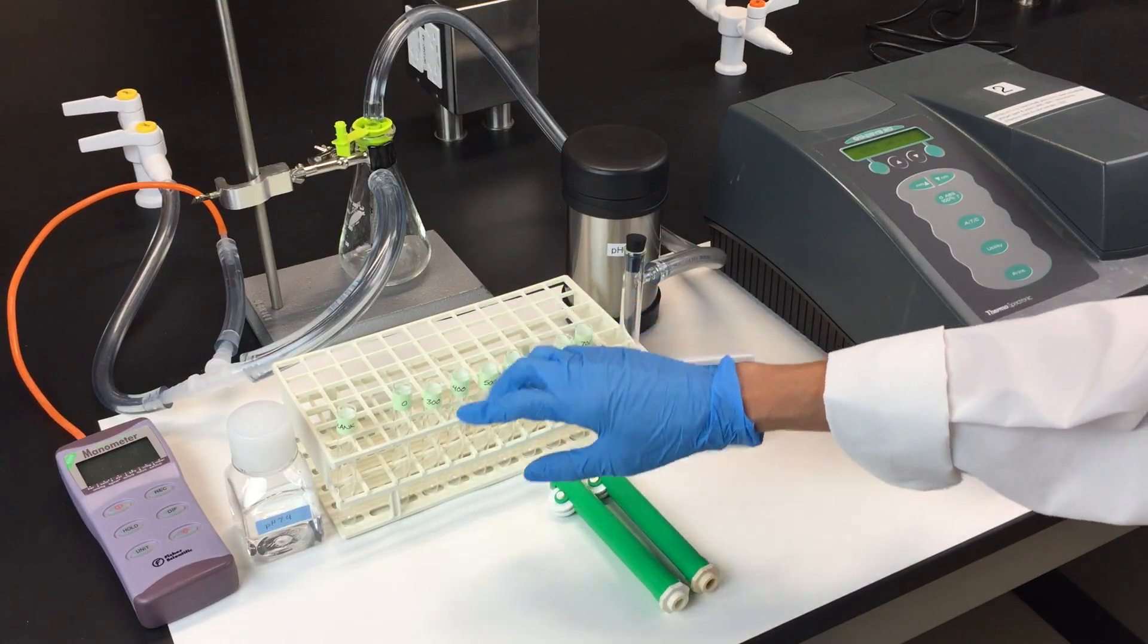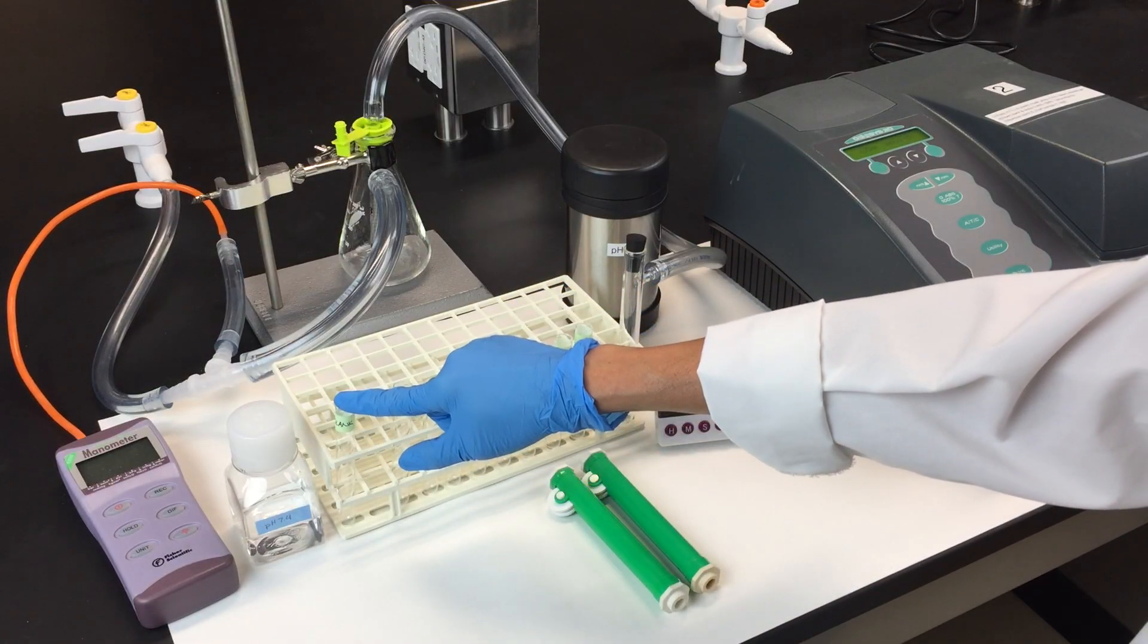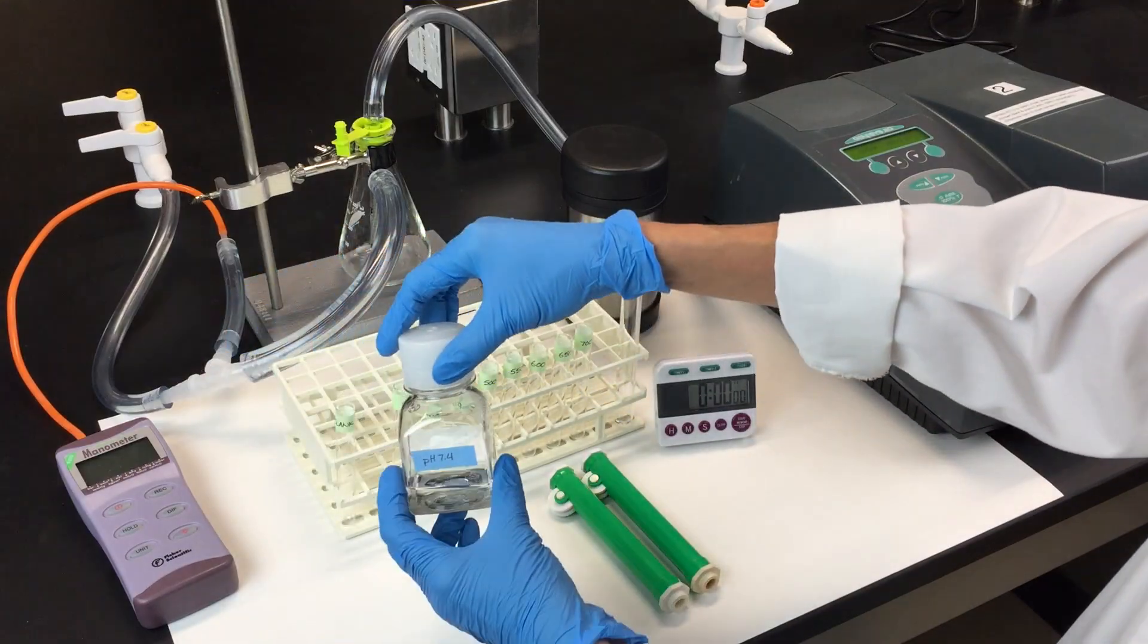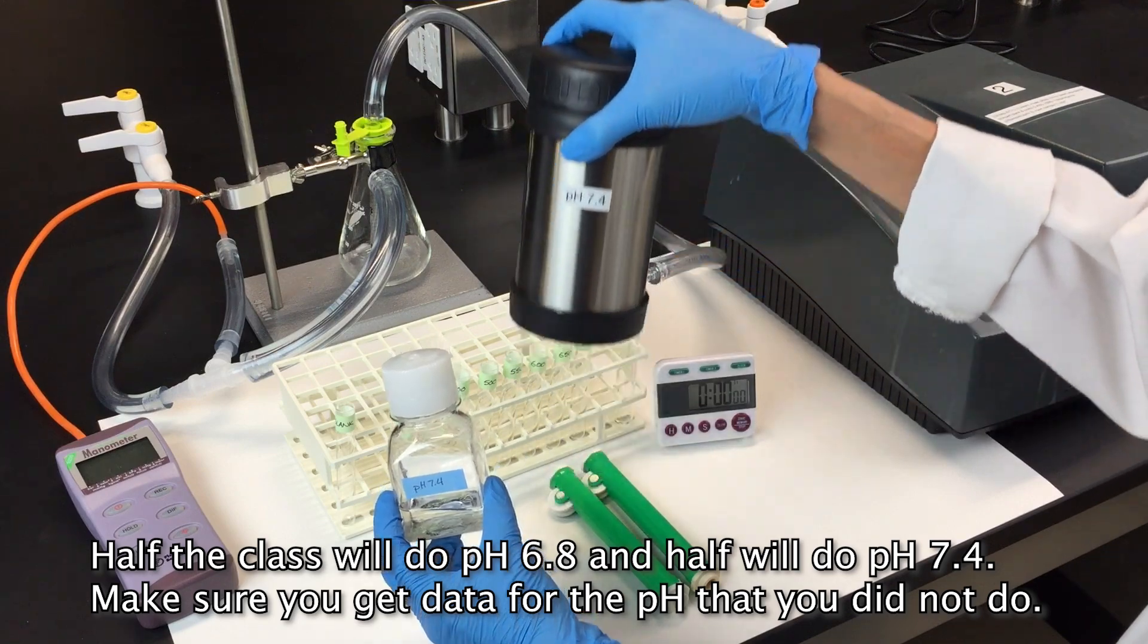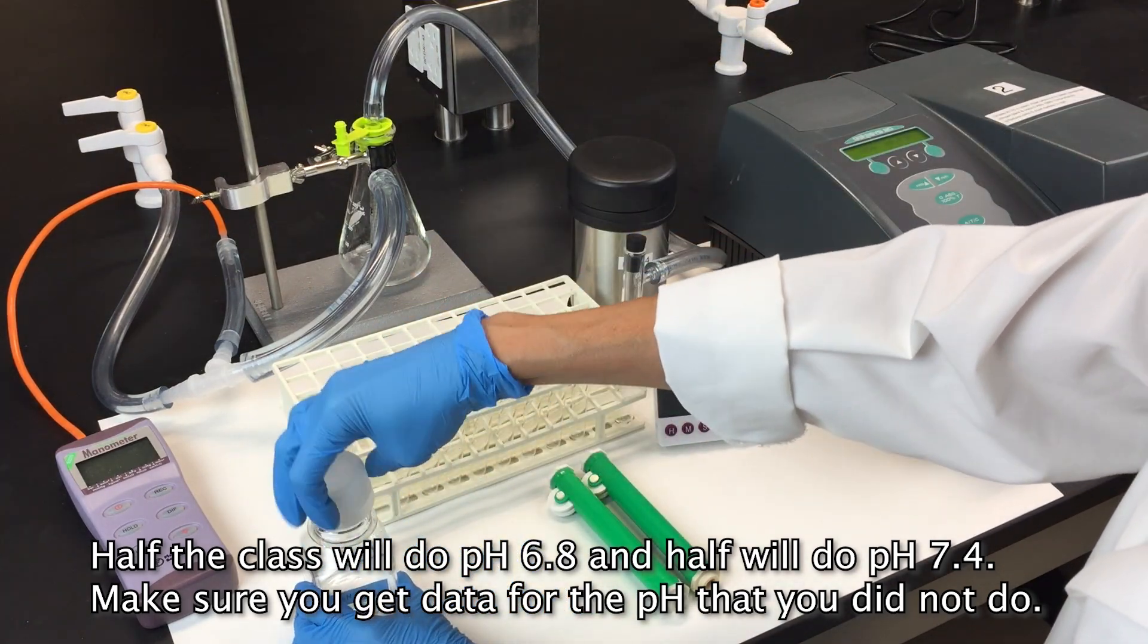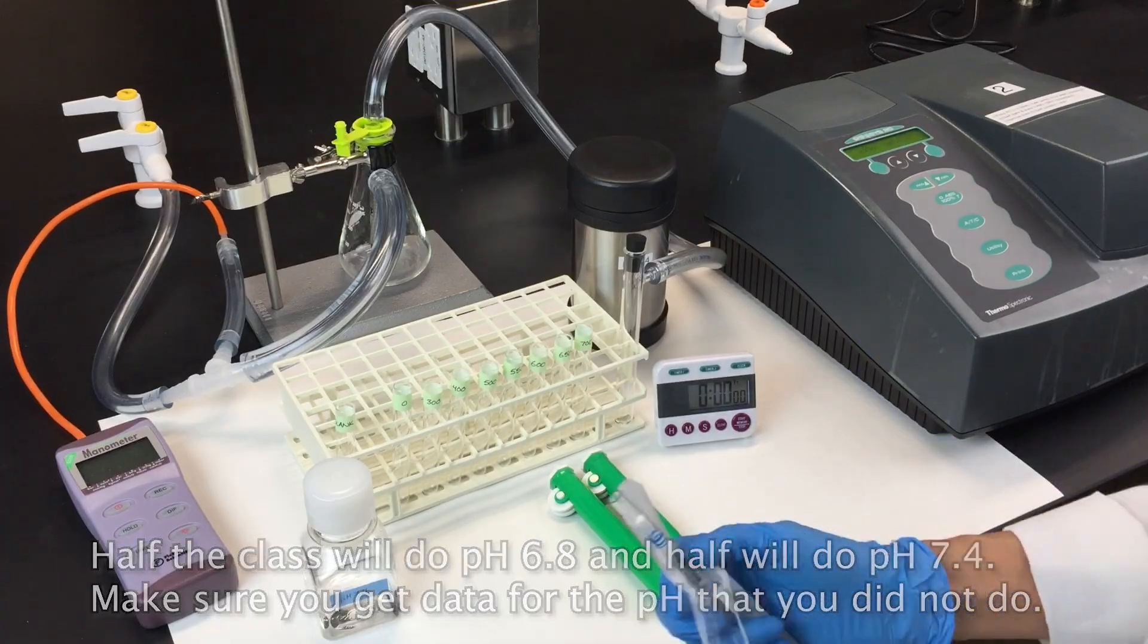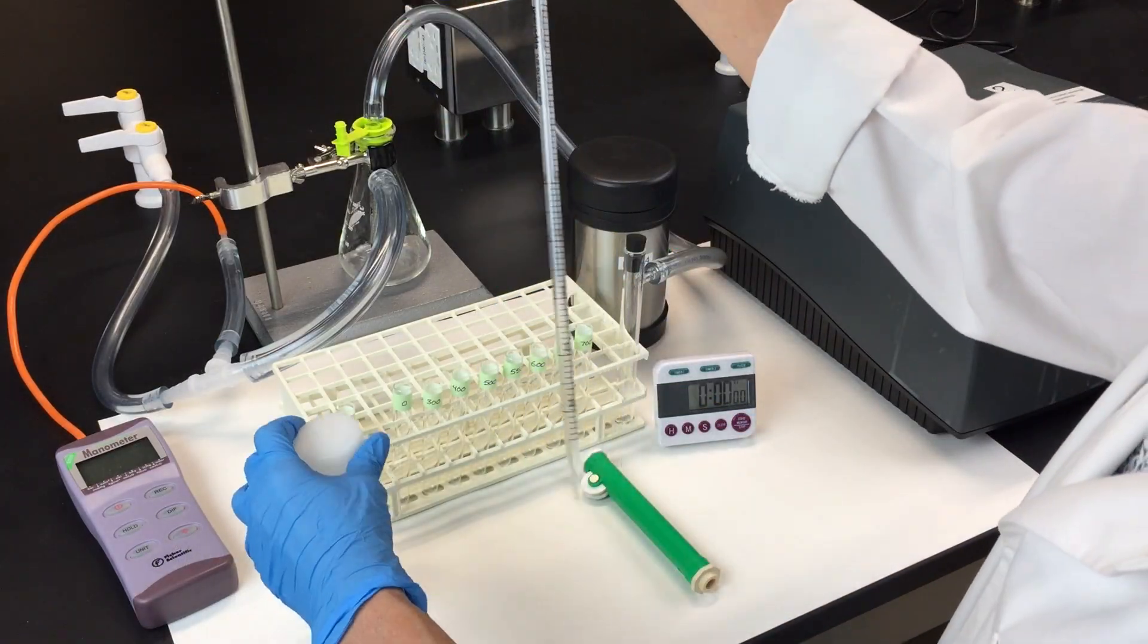Label a series of test tubes for the vacuum pressures you'll be testing and one tube for the blank. For the blank, you'll be using a buffer pHed at the same pH that was used to produce your hemolysate. For this demonstration, we'll use a buffer pHed at 7.4. Transfer 2.5 milliliters of buffer into the blank tube.